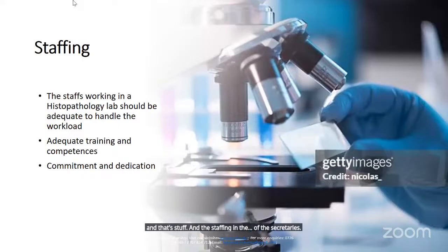The technical team should also be adequate to handle the workload. If a technologist is used to doing 250 blocks of microtomy per day, and then you're telling them to do 500 per day, of course they'll be worn out and they'll not be able to deliver. Then adequate training and competencies.